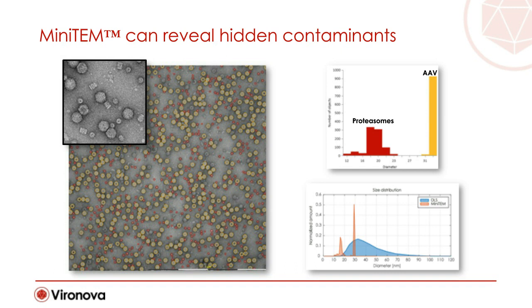As a comparison, the two conformations cannot be distinguished using dynamic light scattering, as seen in the lower right size histogram. We also tested using nanoparticle tracking analysis as a method, but it did not provide any data at all in this case.